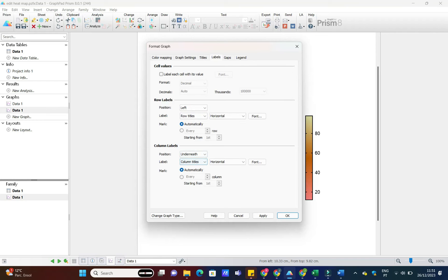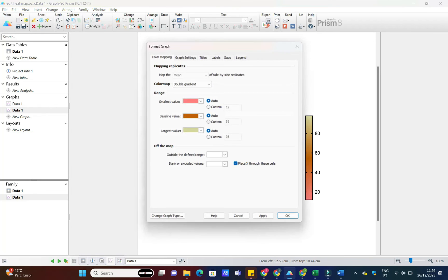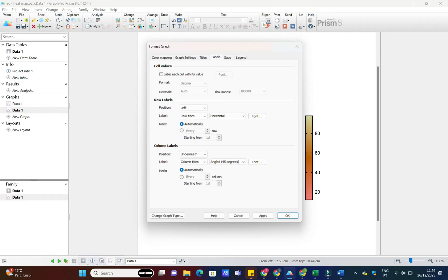Once you're satisfied with your masterpiece, it's time to share it with the world. Go to File Export and choose your preferred format. You can save it as an image, PDF, or even copy it directly into your presentation or report.